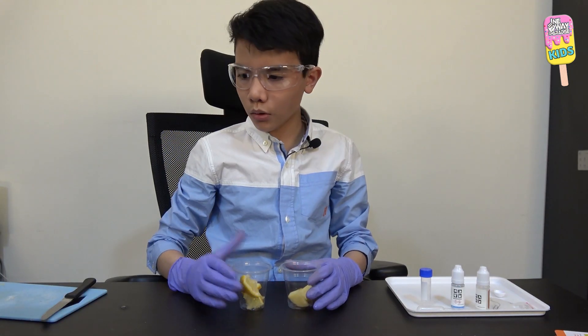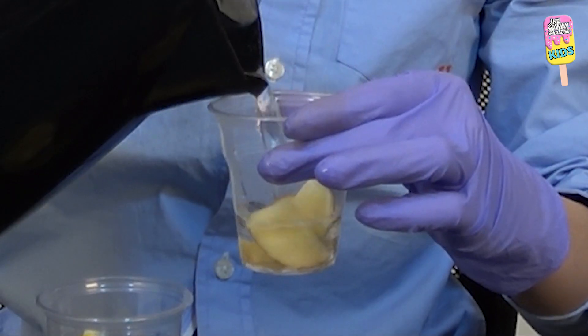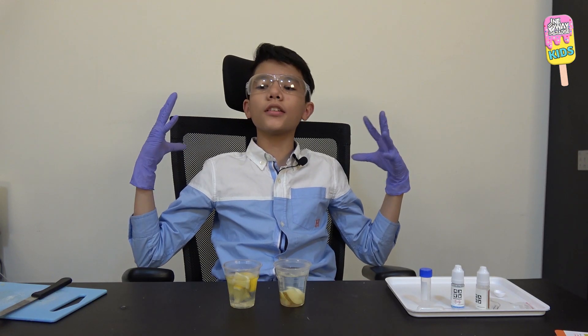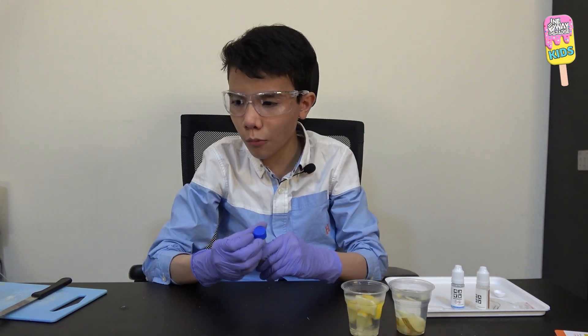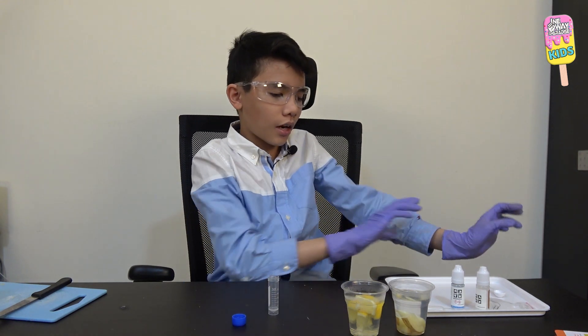Now I'll add boiling water and let that sit for five minutes. After five minutes, time's up! These sat in boiling water for five minutes. Now I'll open the vial — make sure you have your gloves on, because we're now working with the chemicals.